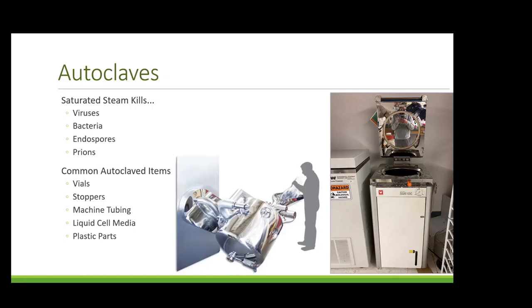This is useful for killing bacteria, endospores, viruses, and destroying prions. Steam is also able to penetrate all kinds of surfaces and materials, allowing it to sterilize multiple layers of cotton. Solid parts that are too sensitive to be sterilized in high-temperature ovens are also autoclaved.